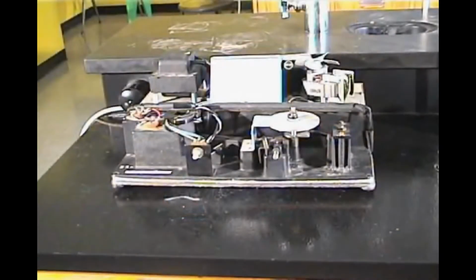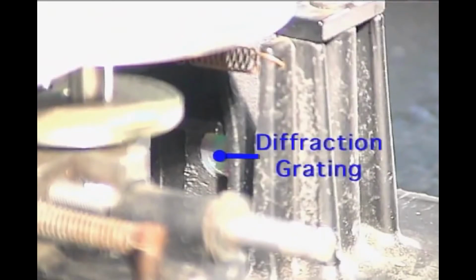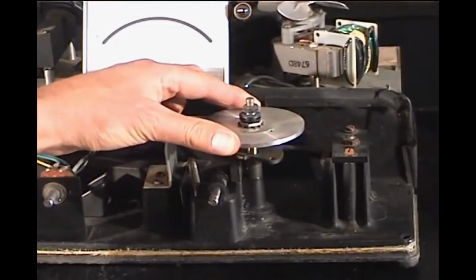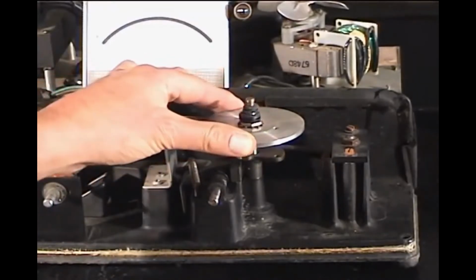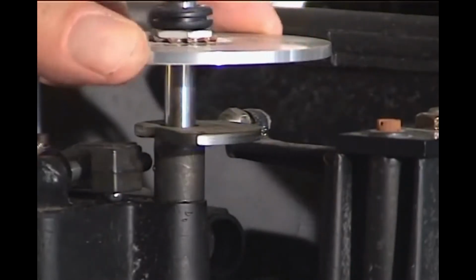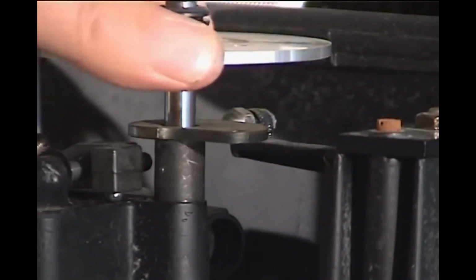Inside the colorimeter, a light source is directed at a diffraction grating that resolves the light into its constituent wavelengths. By turning a dial, one is able to select a narrow range of wavelengths to shine through the sample. That typically is the complement of the color of the sample. In this way, the maximum amount of light will be absorbed.